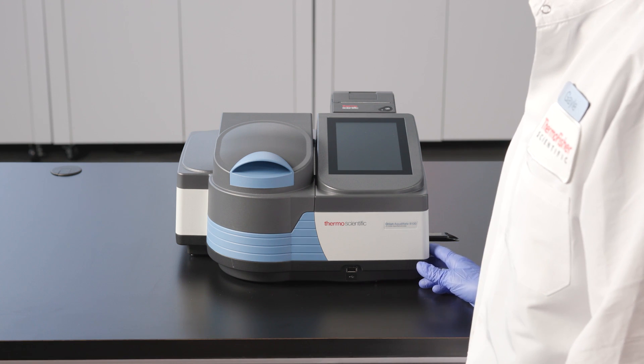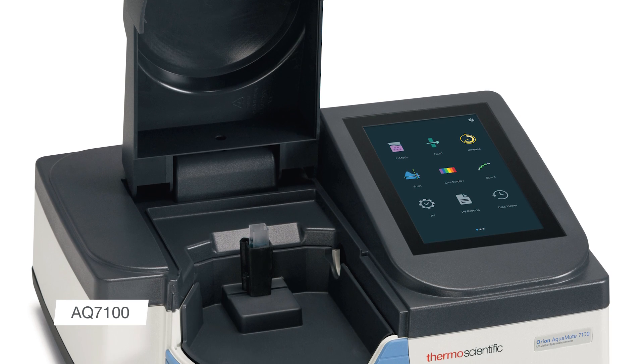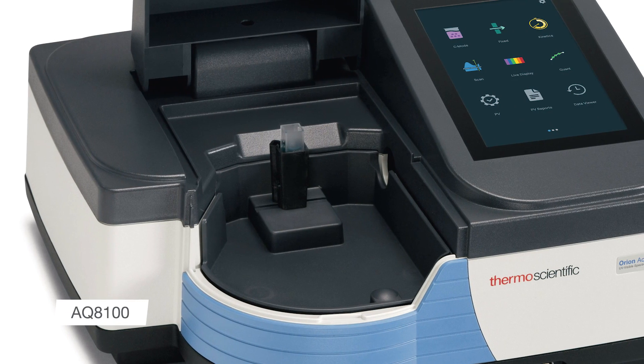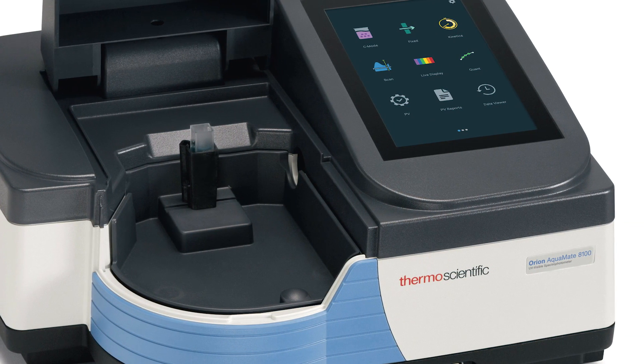There are two Aquamate models available: the AQ7100 visible light spectrophotometer, which has a tungsten halogen lamp, and the AQ8100 UV visible light spectrophotometer that uses a xenon flash lamp.